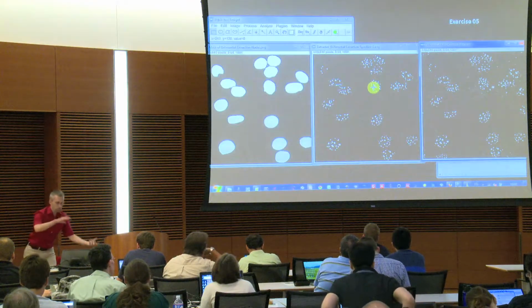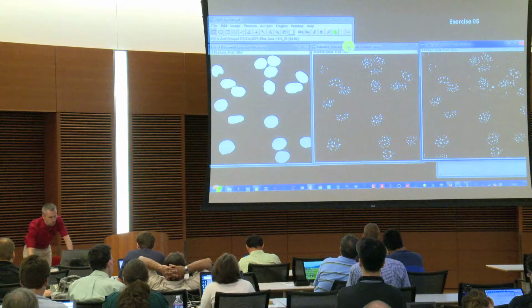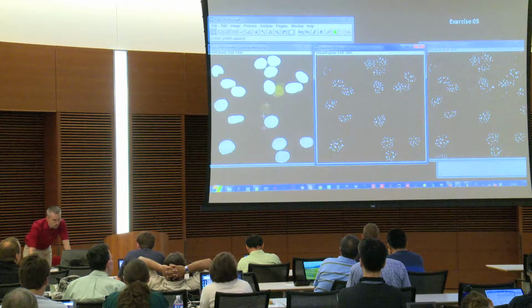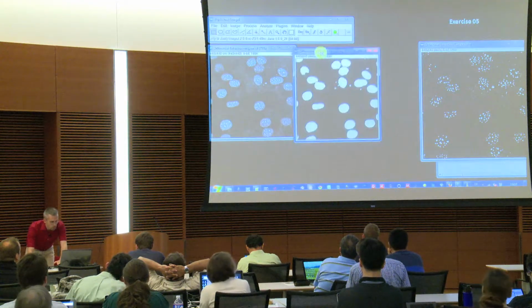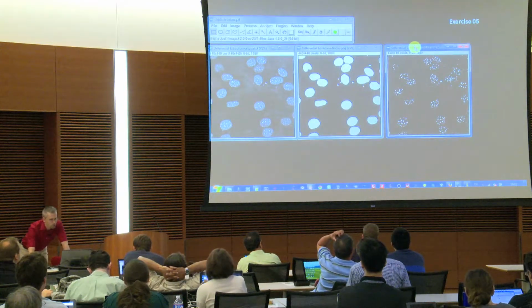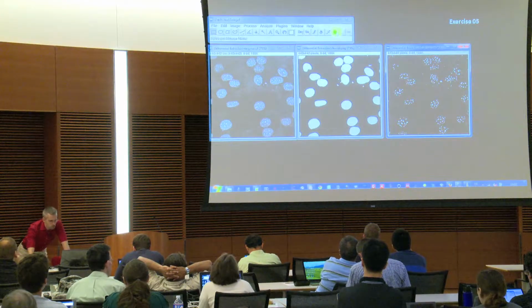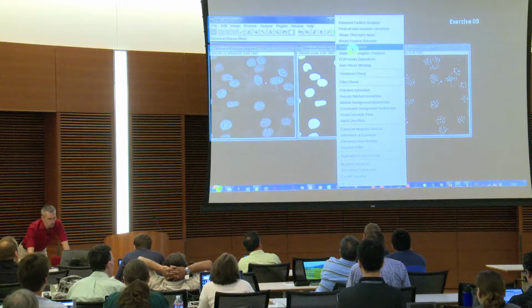But you need to first extract it with the analyzed particles and then also extract objects from here with this one, but this is how you could use the binary feature extractor. So we can close now these extracted images and still keep the very originals, because now I show you an option which does that in one step with different output options. And this is the so-called speckle inspector, if you have again those two original ones, under the green cube.